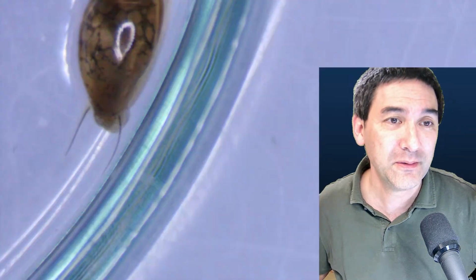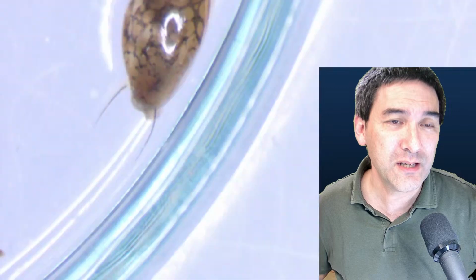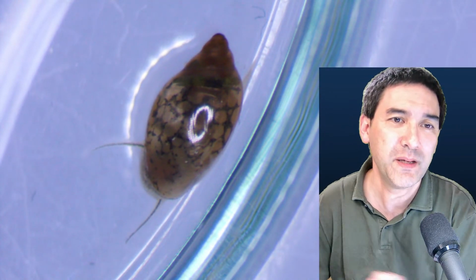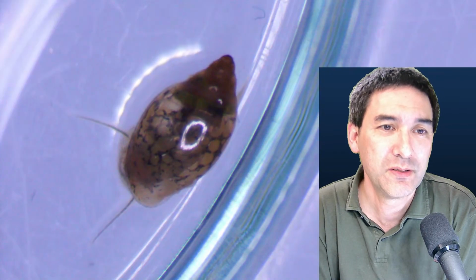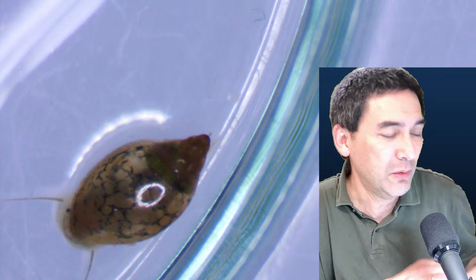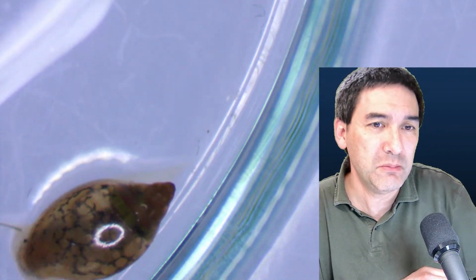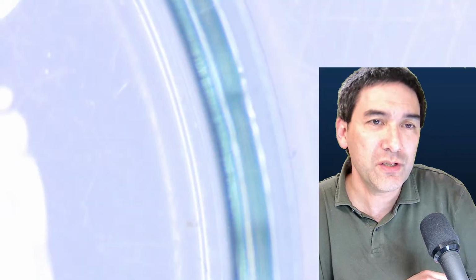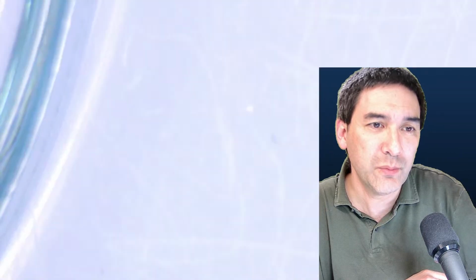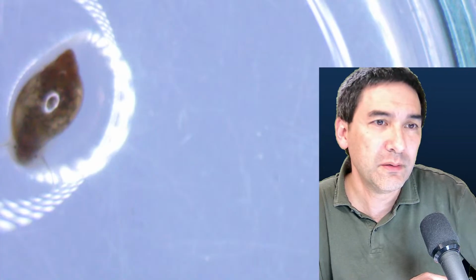See, the camera always adjusts its exposure time, right? And that's essentially what I like doing with hobby microscopy. It's not complicated science that I'm doing. I'm just having a little bit of fun observing nature, because by observing nature, we're also expanding our horizons. So let me quickly adjust it a little bit. Here we go again.